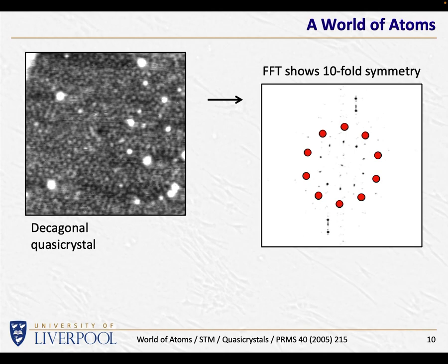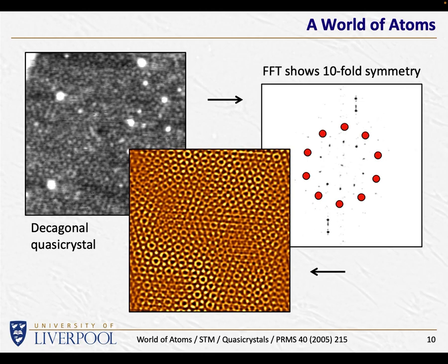doesn't have tenfold symmetry? In other words, having done that analysis, can we go backwards and ask ourselves what the image would have looked like if we didn't have all this horrible contamination on the surface? And the answer is, that's what the atoms are arranged like. And depending on your distance from the screen, you still may not be able to see detail, but I think you can see a lot more structure in there in terms of how the atoms are arranged, which is essentially invisible in the original image.